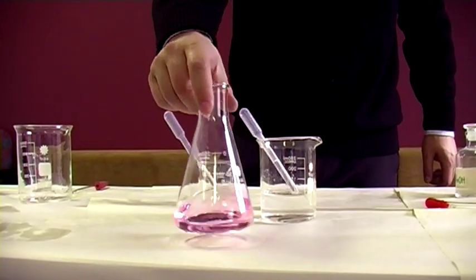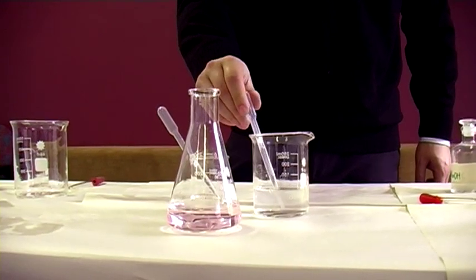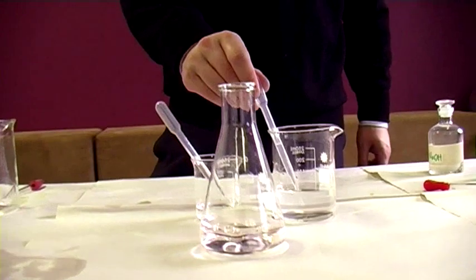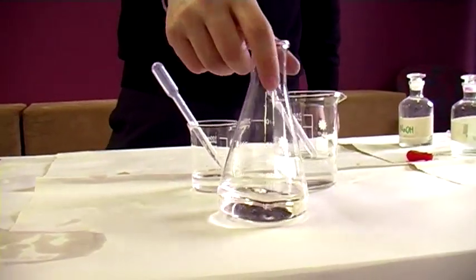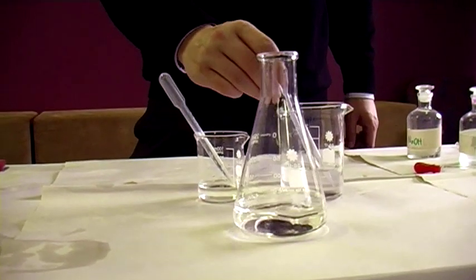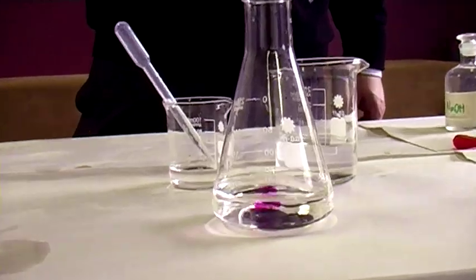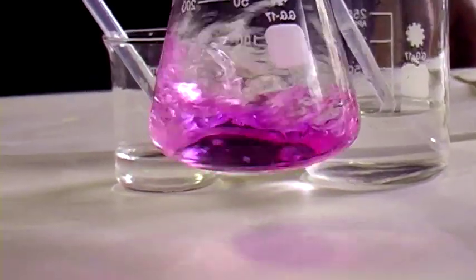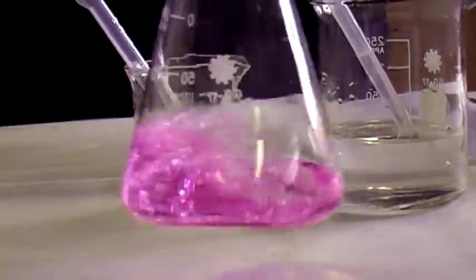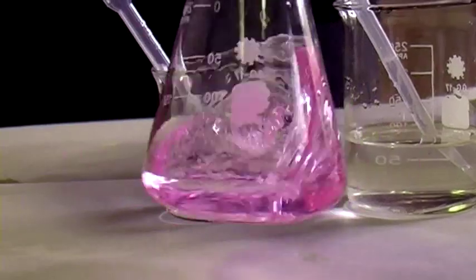If I add one more drop, just to indicate the overshoot — this is pretty much the equivalence point. So during a titration, this is what you should aim to see. You wait for the colour change. Actually, I need one more drop. Hopefully this one drop is enough to permanently change the colour. You have to let it settle a bit, stir it a bit.